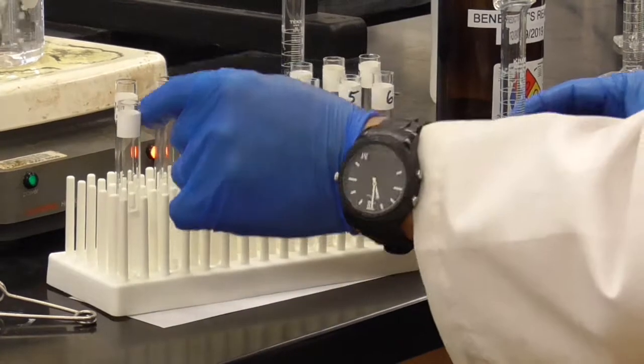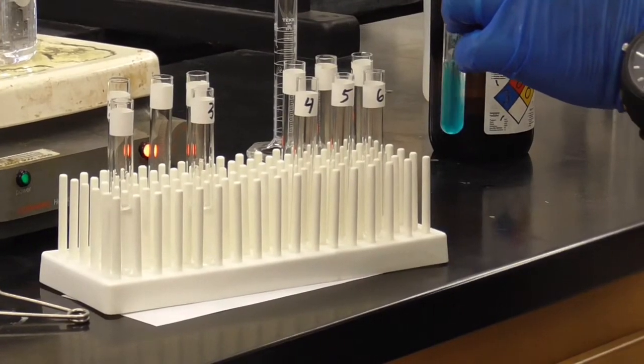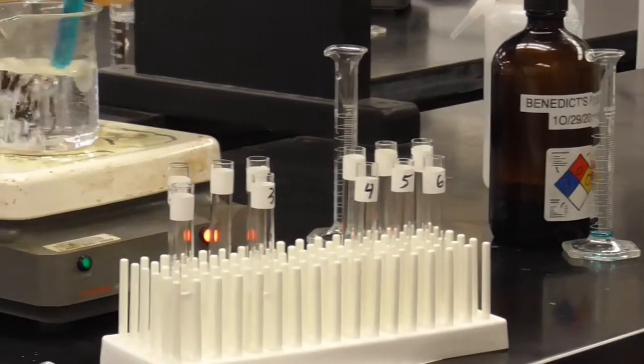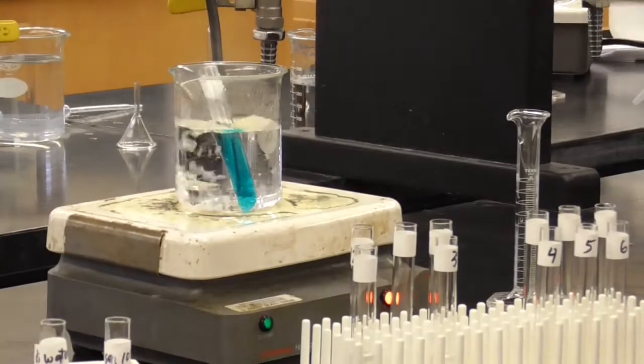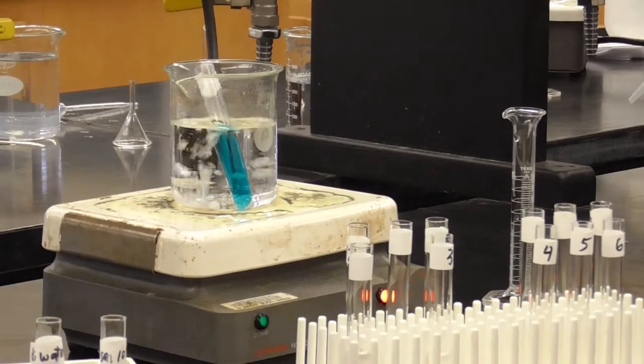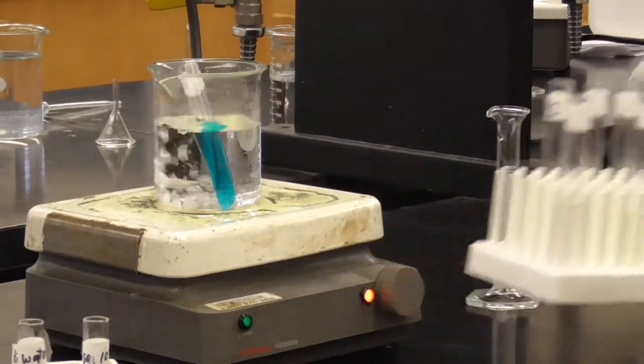We'll use test tube number 2 for this one. Pour that in. And then we heat it up for 3 to 5 minutes. While that's heating up, let's go ahead and do the starch test, and then we'll come back and see about the results on this one.